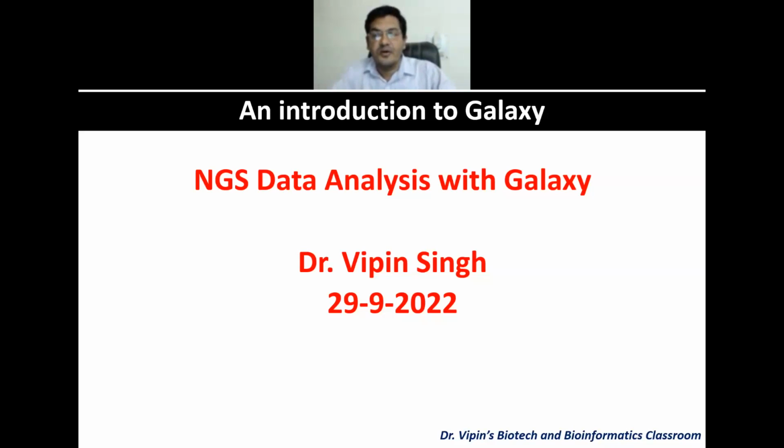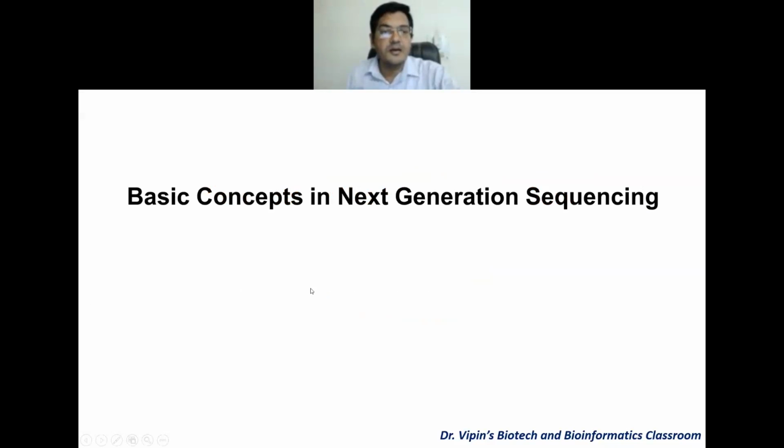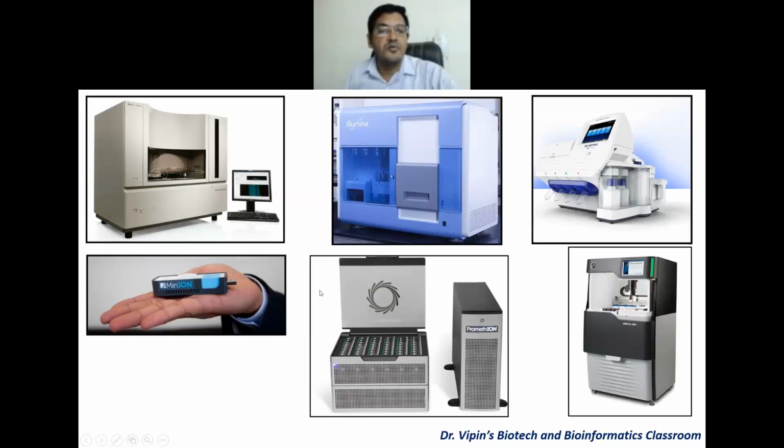So let's get started, and we talk first of a bit of the NGS technique as such, and why it is important to go through these steps before you can finally get a feel of your data. So first, let's talk of basic concepts in next generation sequencing. What we're going to cover today is basically next generation sequencing and a bit of Galaxy.